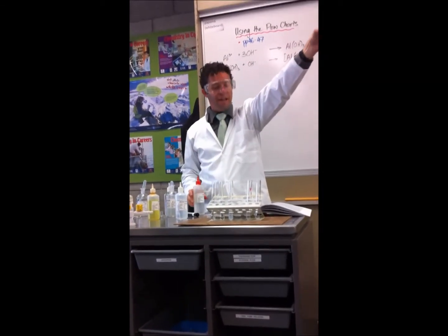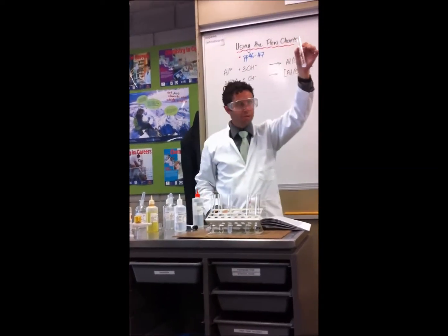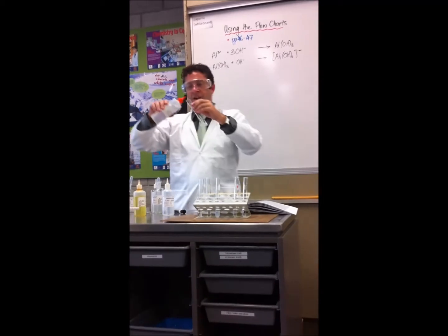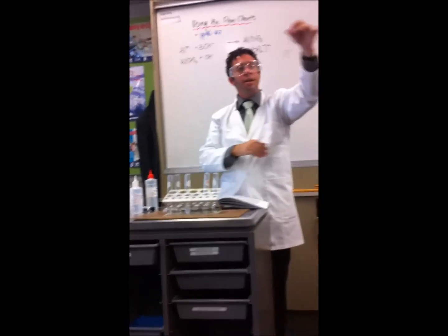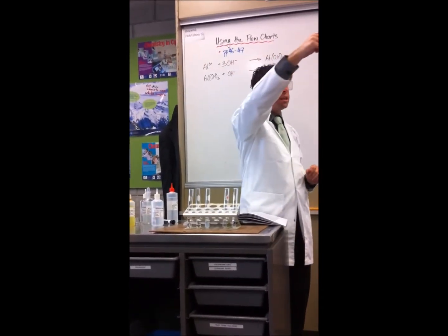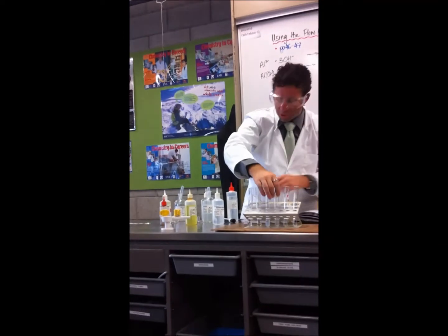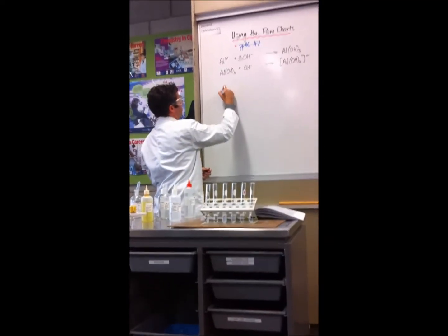And it's gone cloudy. So what are the possible ions there, looking at our flowchart? Lead, aluminium, zinc, magnesium. Great, lead, aluminium, zinc or magnesium. Then it says to add excess, and I do that. And is it still cloudy? Yes. Okay, I'll give it a shake just in case. No, it's still cloudy. So therefore I know straight away which ion it is. It must be magnesium. I prove it, I justify it with an equation.